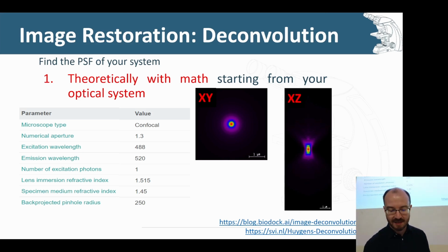So what that means is, if I'm going to convolve a three-dimensional structure over my Z stack, for example, I will be including some of the information of lower down layers into the layer that I'm currently looking at. For the slice that I'm currently looking at, some of the slices below and above, that information or intensities will be poured into this central layer. And what deconvolution is trying to do is throw that out again so that I only have the information for the slice that I'm actually looking at.